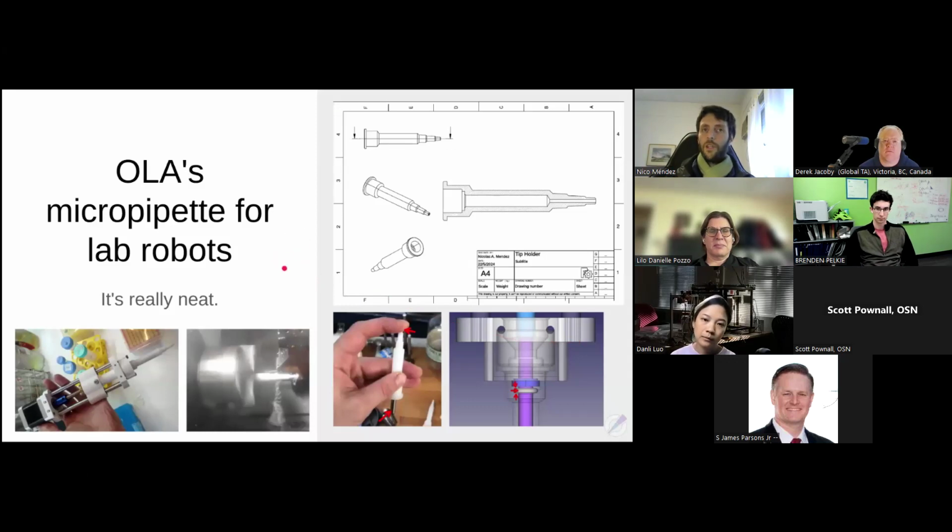This has been going on for a couple of years, and it was really nice to see the OT2 tear down, because I got the feeling that we were doing things really well. And this is our new pipette. So it's very simple. Here's the tip holder. As I said, it can hold multiple tips. And the way that it ejects them is to move to a certain position, and there's a fixed ejector in one place, because we have not yet implemented the multi-tip ejector that goes over it.